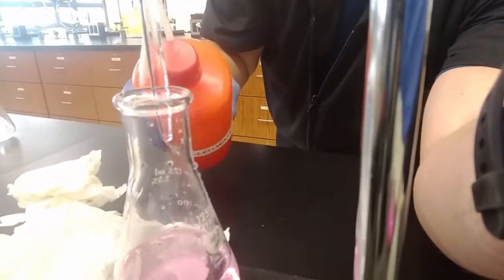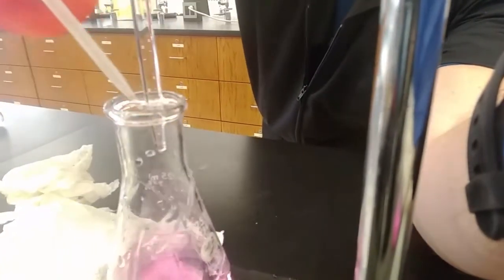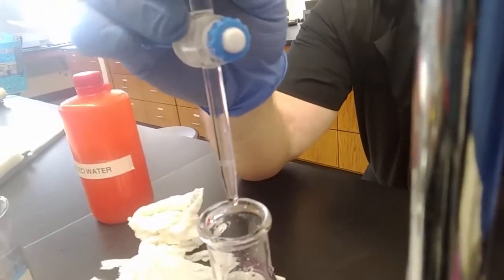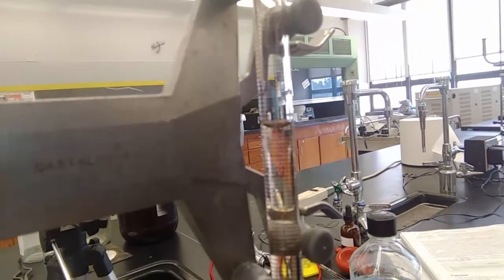Double check, rinse down the side of the flask. Just make sure everything is washed down in. Definitely still pink. I need my final reading, again, in the way. And as expected, it's between 19 and 20. It's actually between 19.8 and 19.9, but really, really close to 19.9.